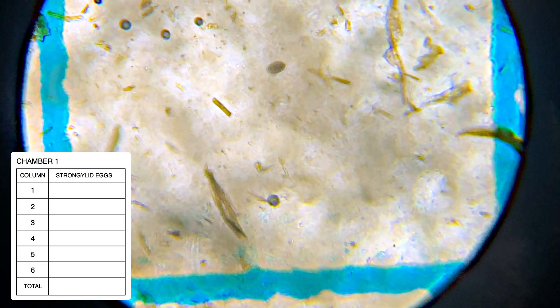To demonstrate what we've learned so far, let's go through an example slide, identifying and tallying eggs as we go. See if you can spot the strongylids before they're marked on the screen.